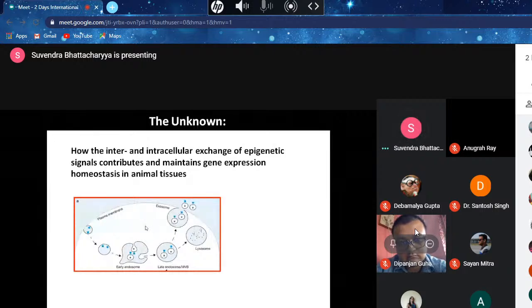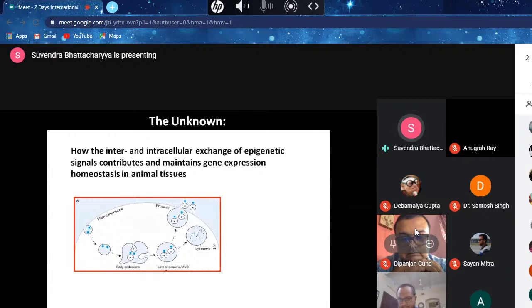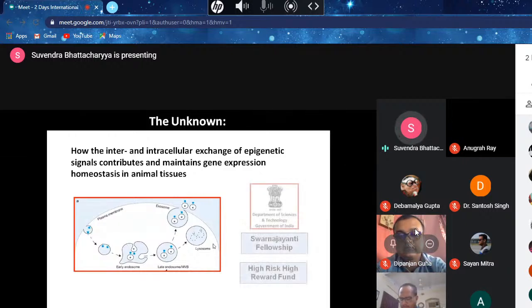So all those things involve cellular dynamics of organelles and their interaction among the organelles, which can only be visualized with the microscopic techniques. So the biochemical data that we are always gathering with these organelles can be substantiated or strengthened by the good microscopic techniques that we follow. So I was probably able to highlight how the microscopic technique helped us get into more detail of the mechanistic understanding of the whole process at different levels.